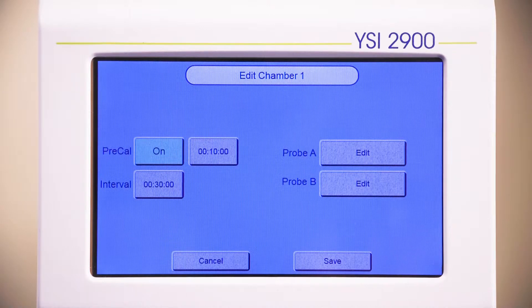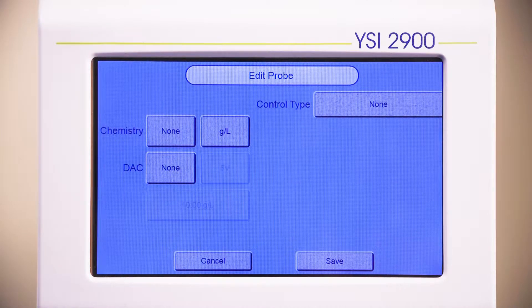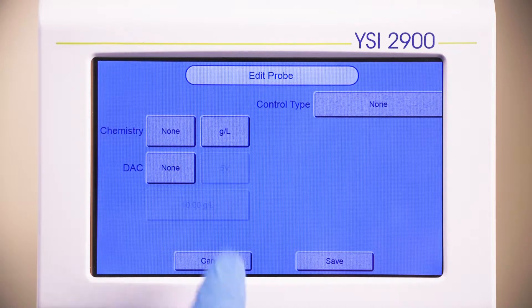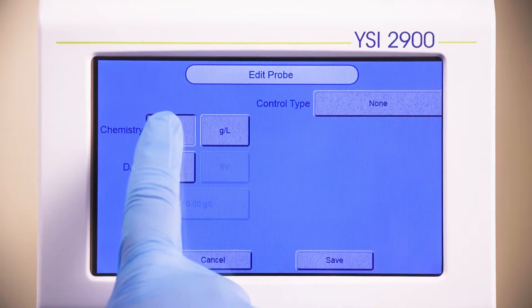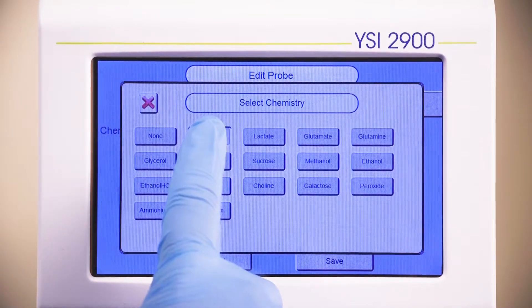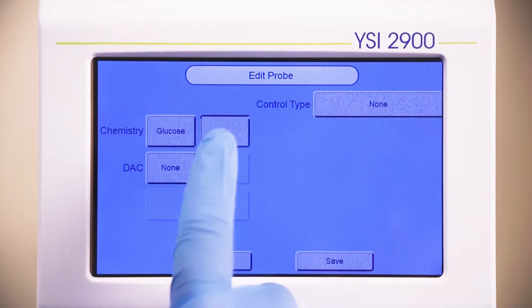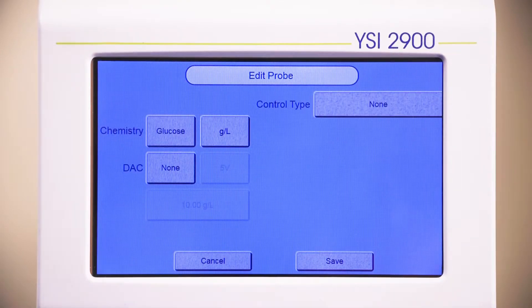Select Edit for Probe A. You can set multiple probes with different parameters. The probe settings are routines that you can set up, save, and run any time. Select the chemistry that you would like to monitor. For this setup, we will select Glucose. Select the units for measurement. The analog output, or DAC, is set to None by default.